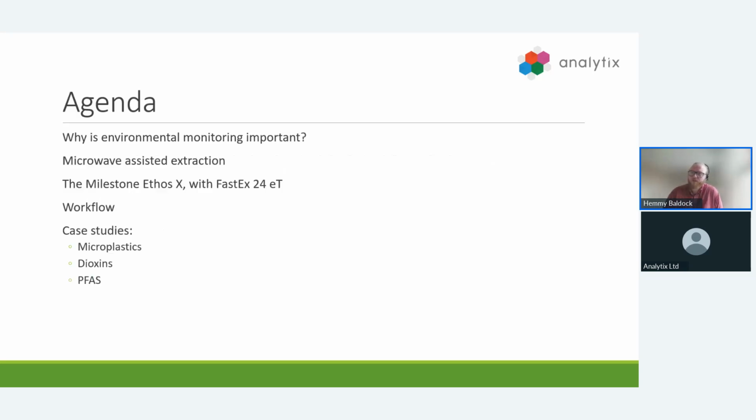So on today's agenda, I will be covering why environmental monitoring is important and microwave assisted extraction as a technique. Specifically, we'll talk about the use of the Milestone Ethos X platform with the FastX24 rotor. We will talk about the workflows using this system, and then we'll go into some real-world case studies talking about microplastics, dioxins, and PFAS analysis.